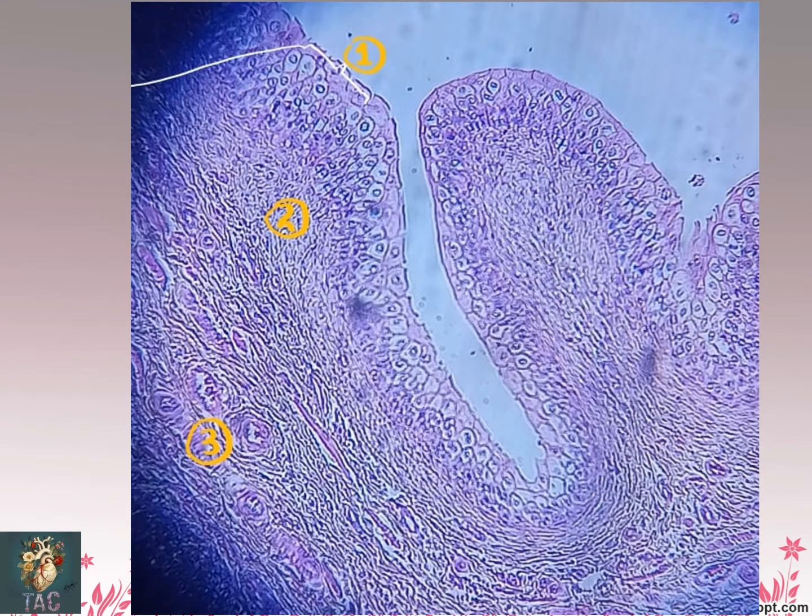This is another slide for the first look at the thickness of the epithelium. So you can see this thickness shows you that these are multiple layers, meaning it is stratified. First point you should notice is that this is not simple, this is stratified epithelium. Second point which is important, you must notice that the surface cells are typically dome shaped.